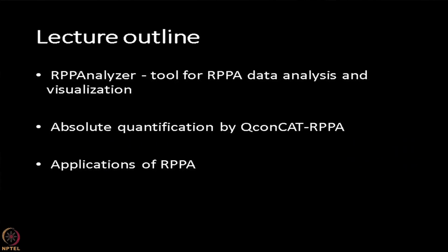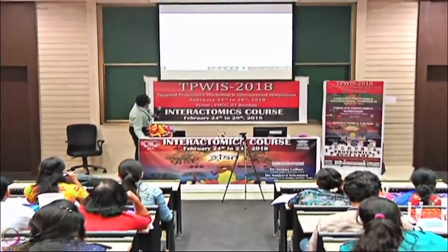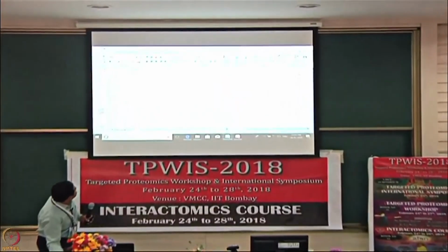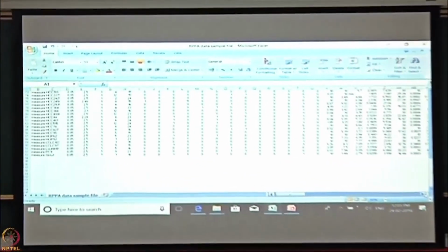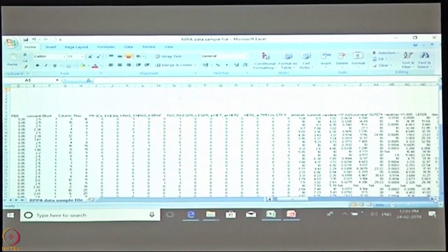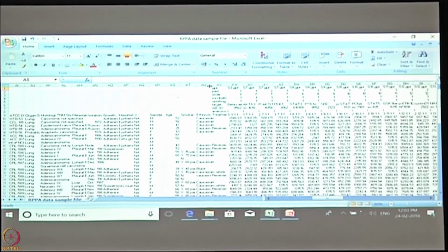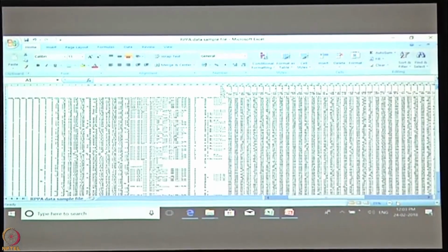I will show you what kind of data we have generated. So, here let us say for example, these are the different samples, these are the different mutations in the cell lines. So, you can see that this is the data we could generate. So, in this corner the drug resistance can be incorporated here. So, this kind of numbers you will get. So, these are the target names. So, your complex matrix will be like this.